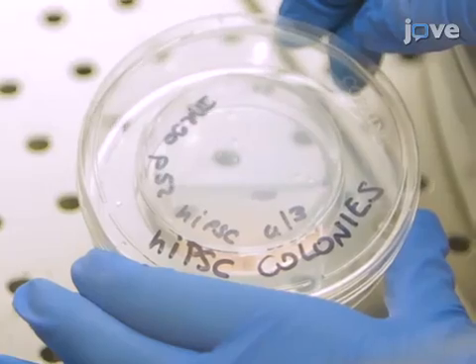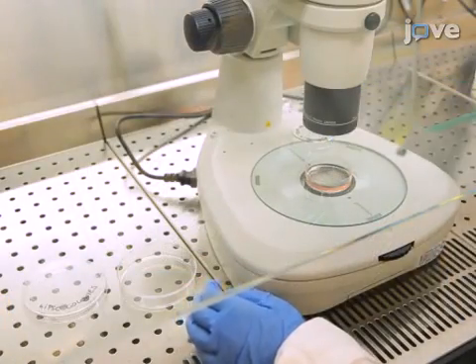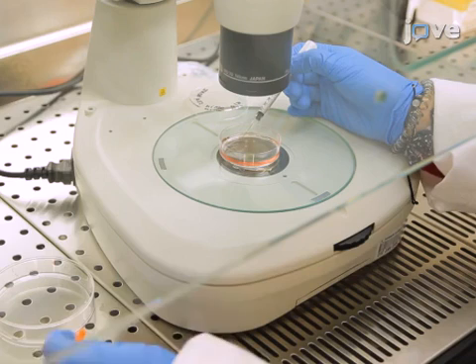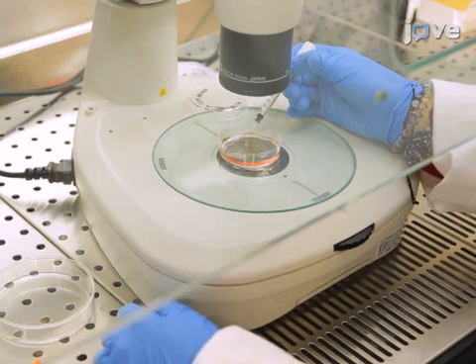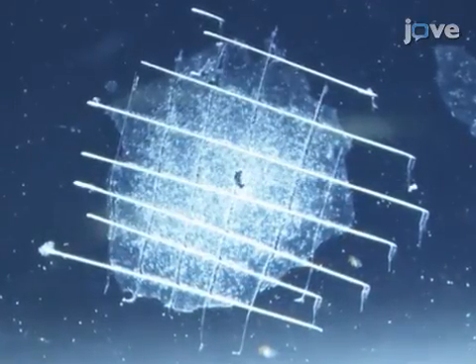Begin by passaging the hiPSC colonies. Working under a stereoscopic microscope at 4x magnification in a laminar flow cabinet, use a 1 milliliter syringe with a 30-gauge needle. Cut the stem cell colonies in squares of about 200 microns by 200 microns.